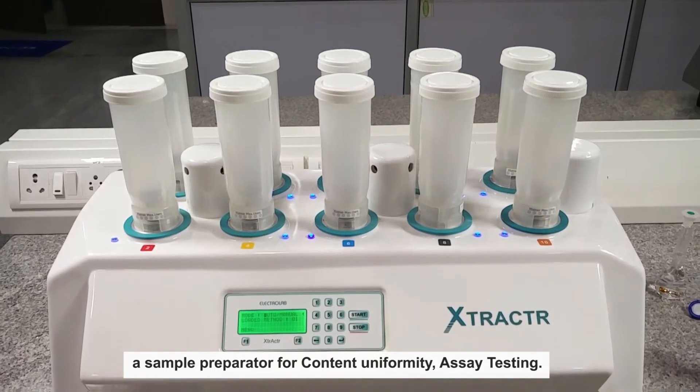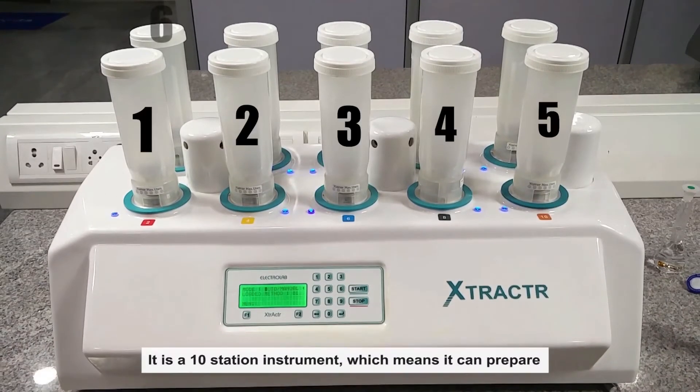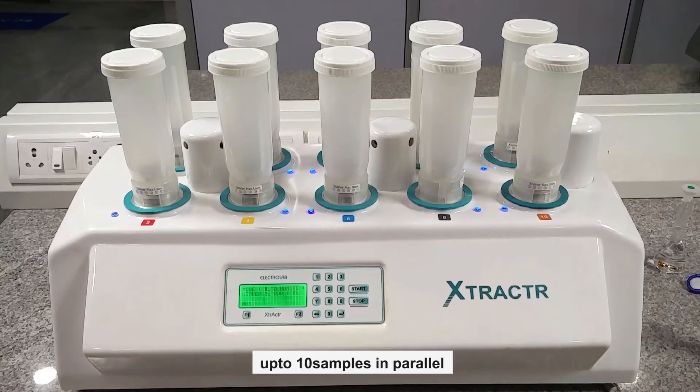This is Extractor 10, a sample preparator for content uniformity and assay testing. It is a 10-station instrument, which means it can prepare up to 10 samples in parallel.